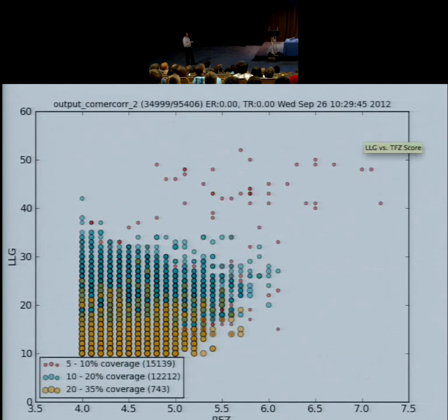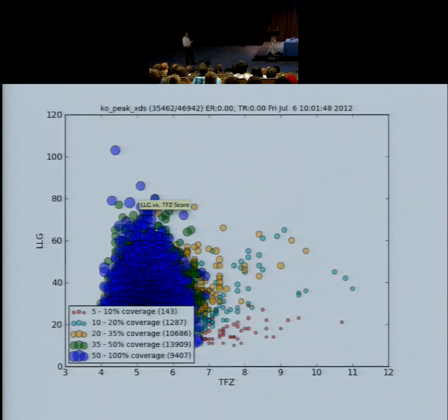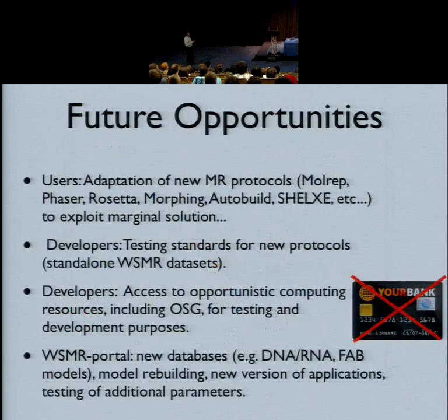I looked actually at some of those domains belong to the same cluster, so that is probably a correct solution as well. This is a very nice spread, and you probably want to use this one for molecular replacement. This one, it's not obvious. Maybe it didn't work. Okay, so future opportunities.